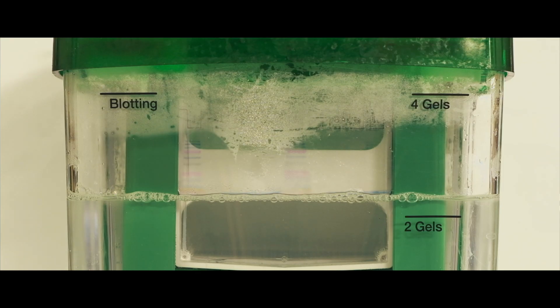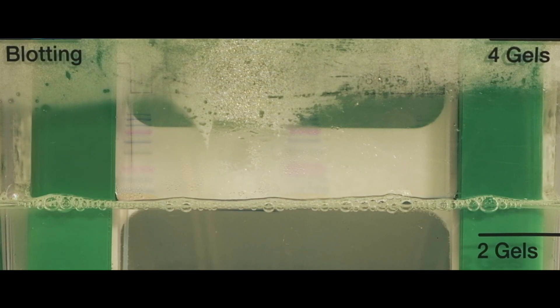It should be noted that at this point we still cannot see any of the proteins from the sample on the gel, as they have not been stained with anything. So we use a protein ladder, which contains a number of proteins of known size, and add it in a separate well. Now we can have something to compare our samples to.